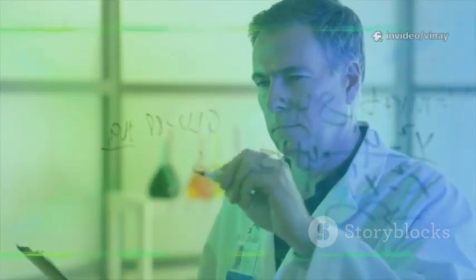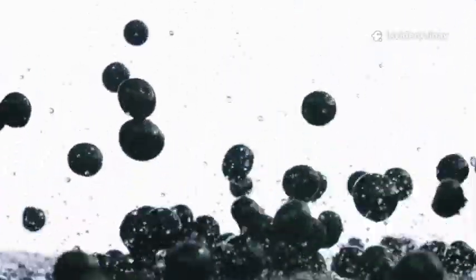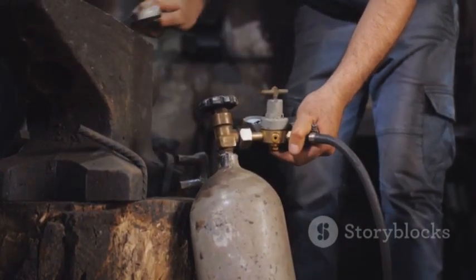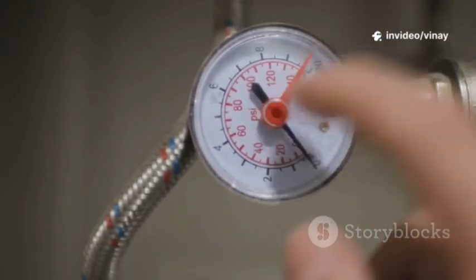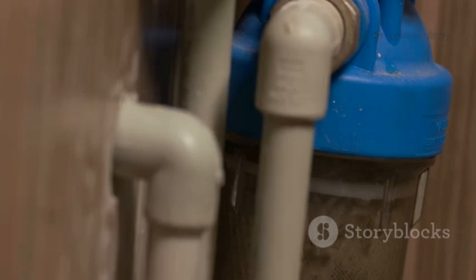The principle we are using here is based on a law of physics called Fick's law of diffusion, which describes how particles move from an area of high concentration to low concentration. After wetting the filter, we apply a constant gas pressure to one side. This pressure is set to be high, but still below the filter's known bubble point. At this pressure, the gas isn't strong enough to push the liquid out of the pores and create a stream of bubbles.